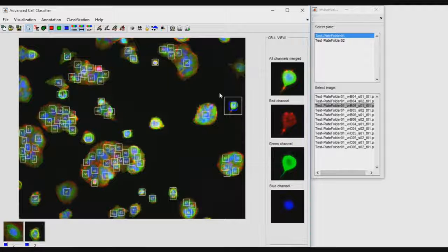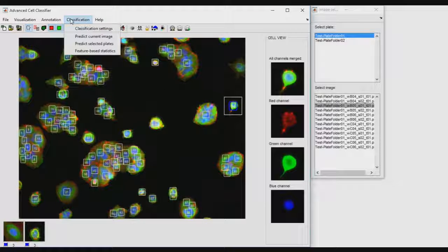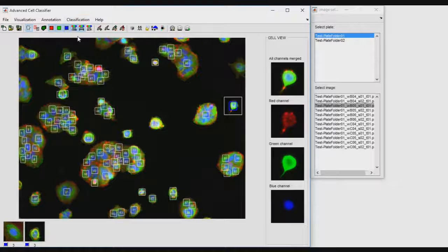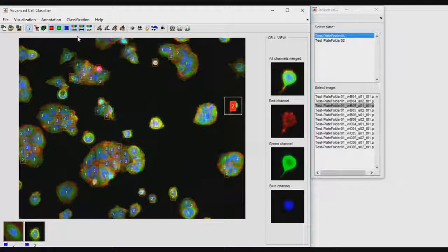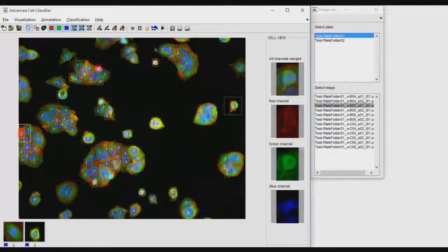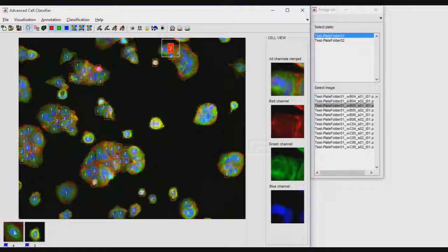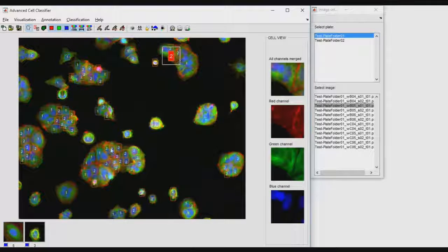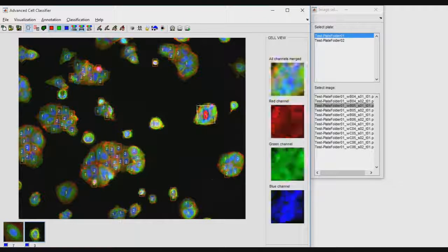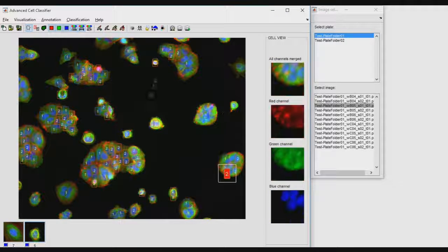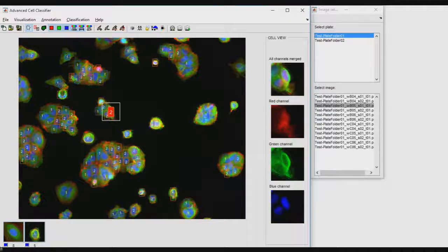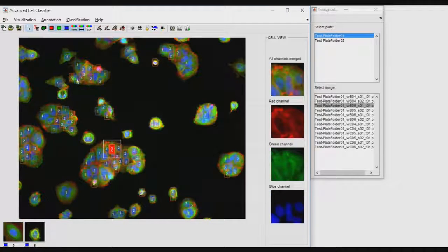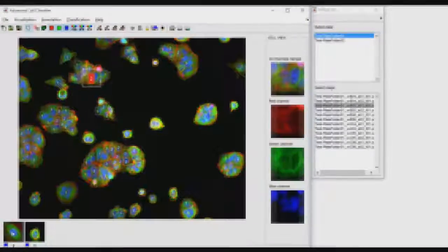To check training quality, one can click on the classification Predict Current Image buttons. Incorrectly classified cells may be corrected at this step to improve classification results. It is recommended to repeat this step several times by analyzing different images.